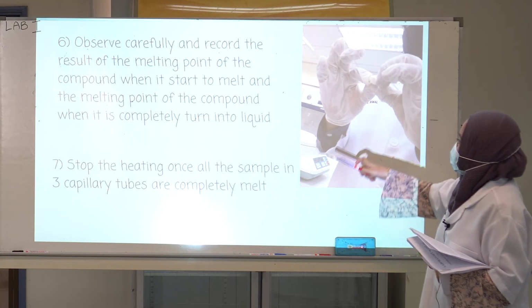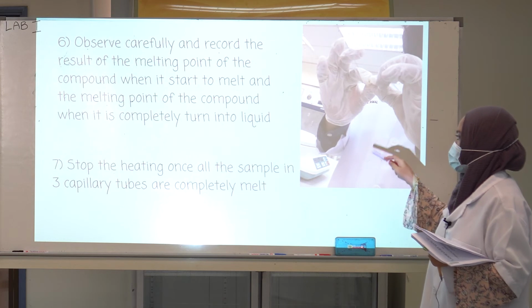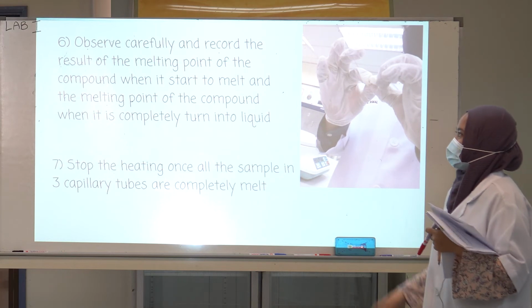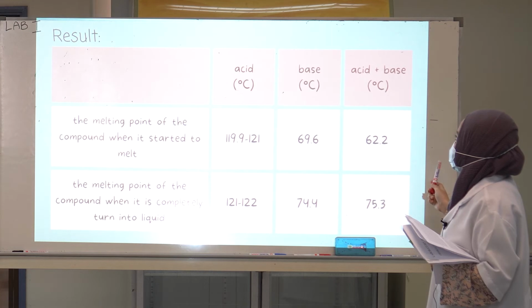And lastly, after all the samples are melted, we can stop heating. And this is the result.